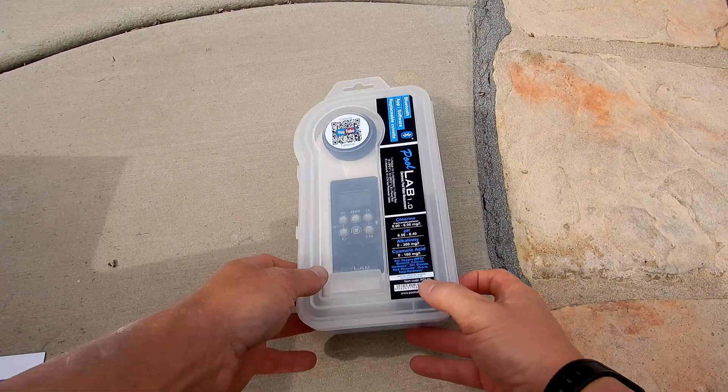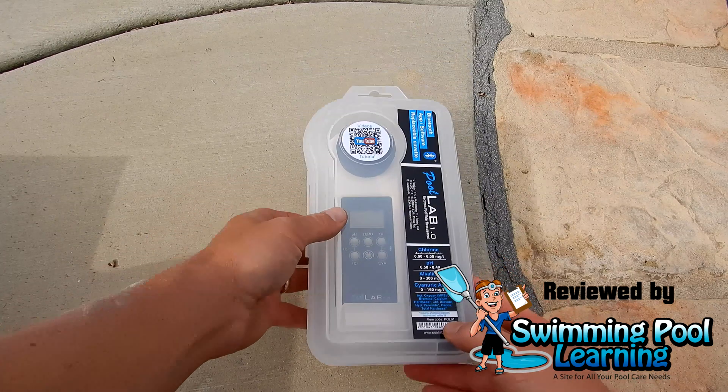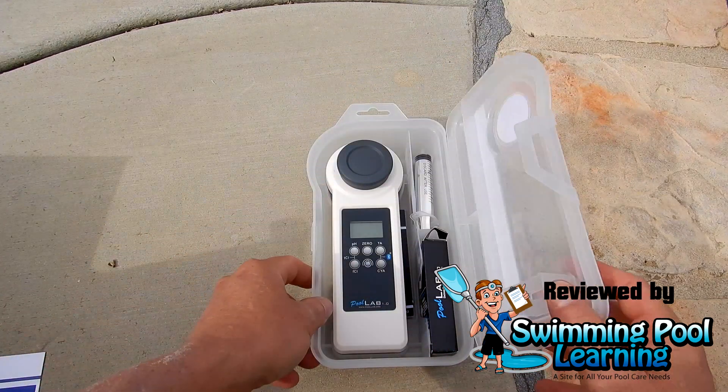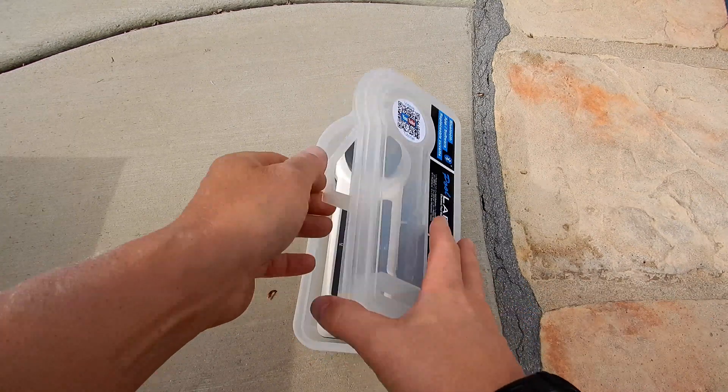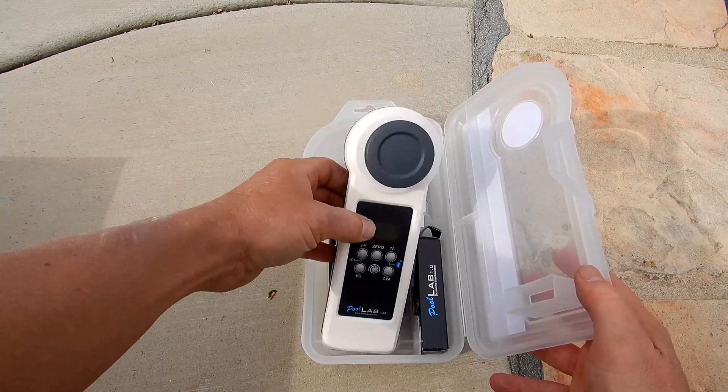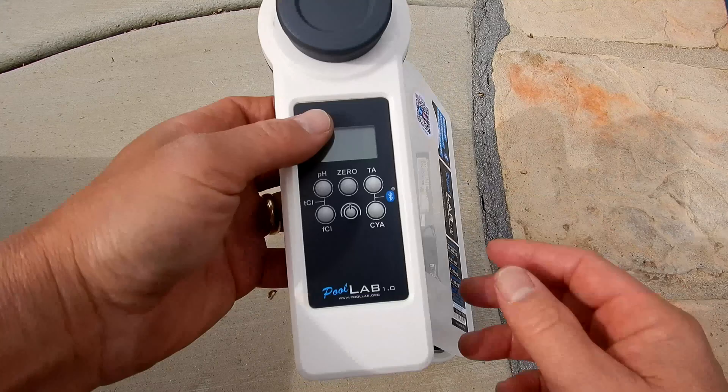In this video I'm going to show you the PoolLab 1.0 Photometer Water Tester. This is a digital tester that does 11 test factors. One thing that I really like is this case here where you can keep the photometer and also your tabs for the testing.